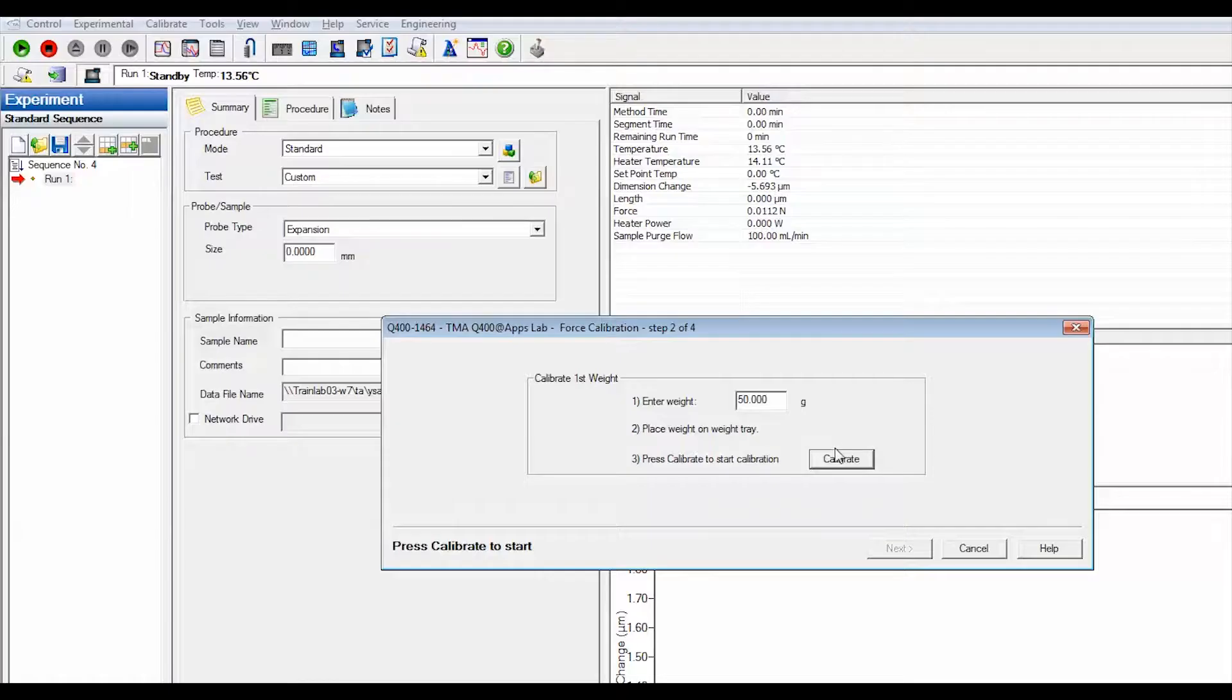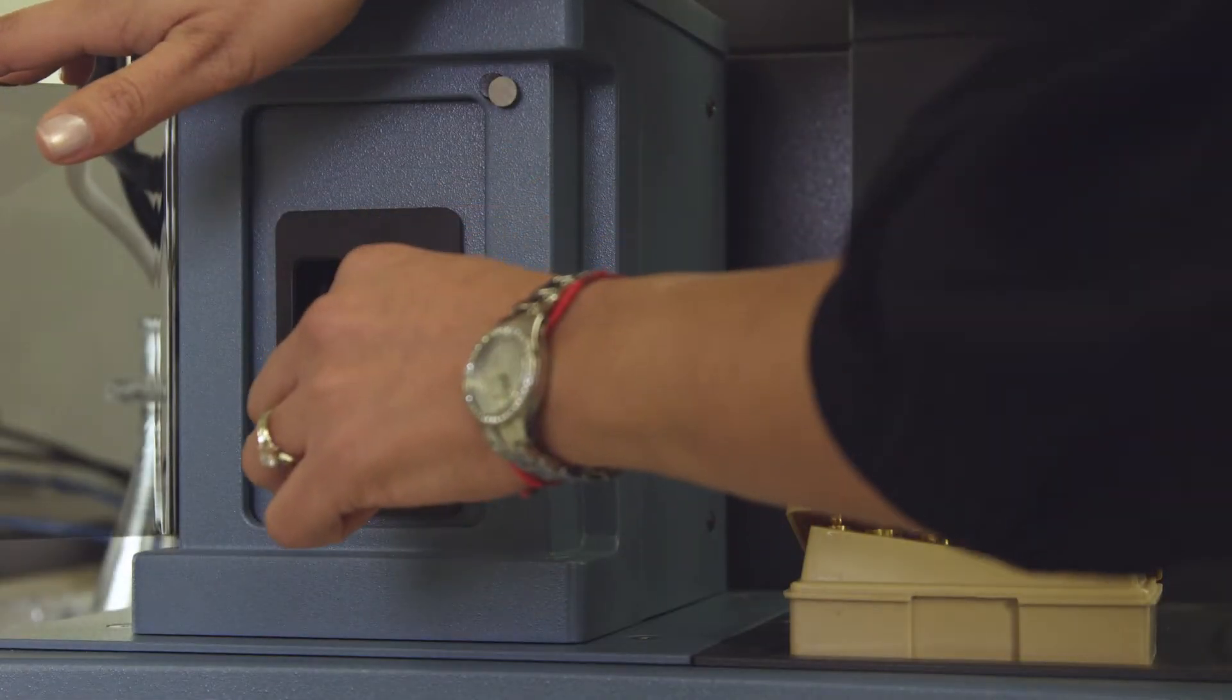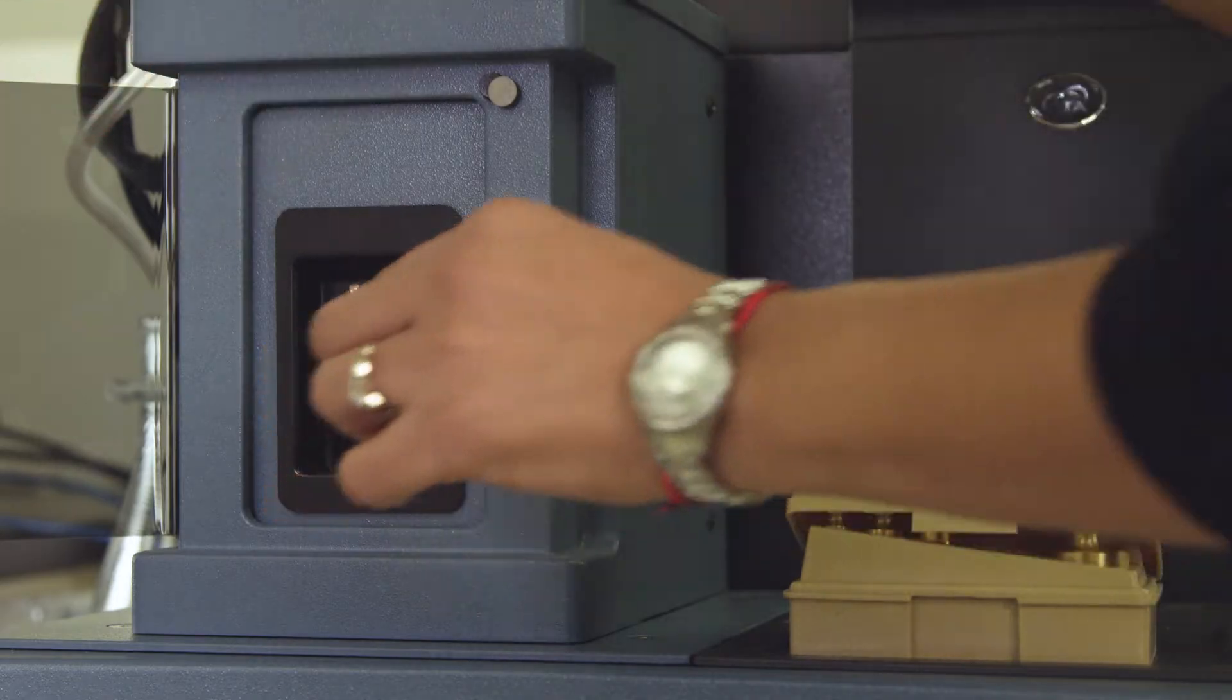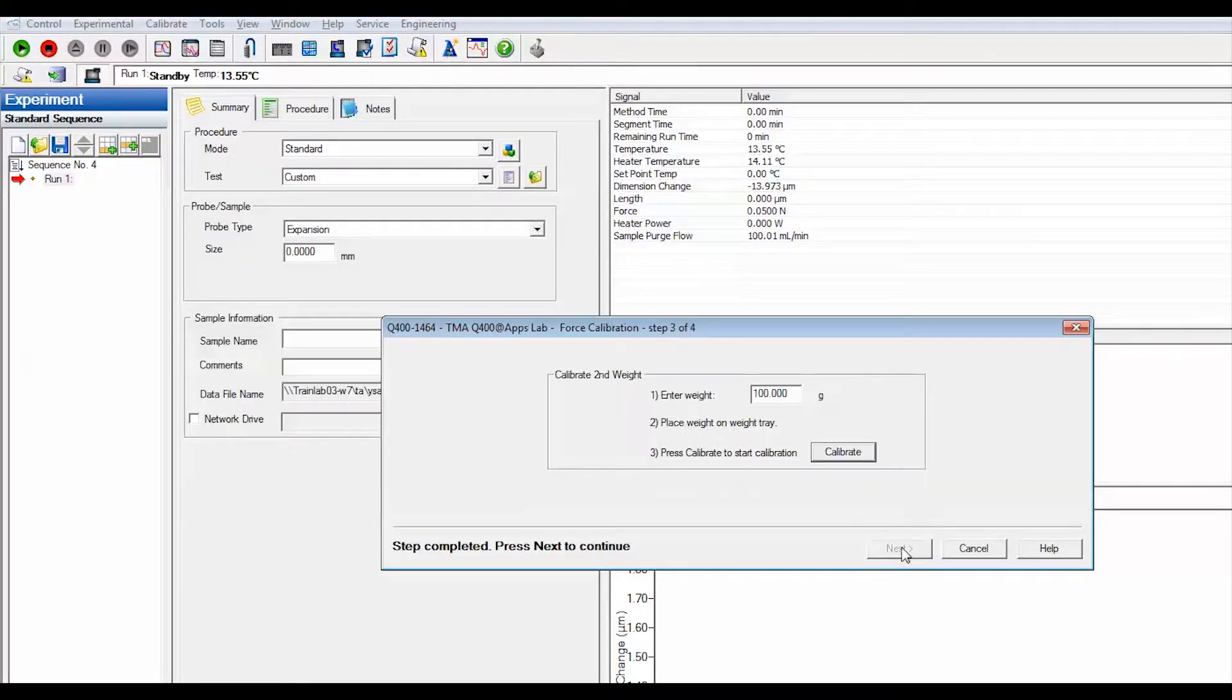Press calibrate. When this calibration is completed, remove the weight from the tray and select next.